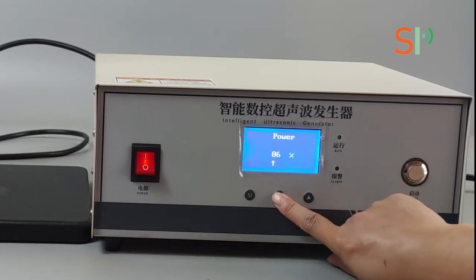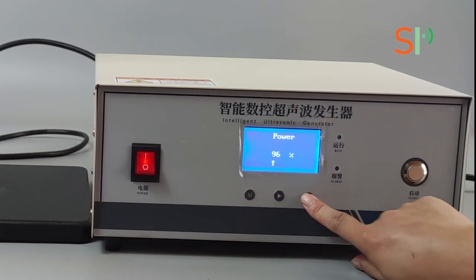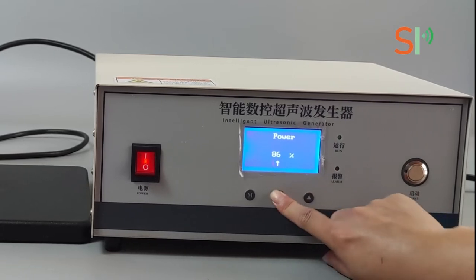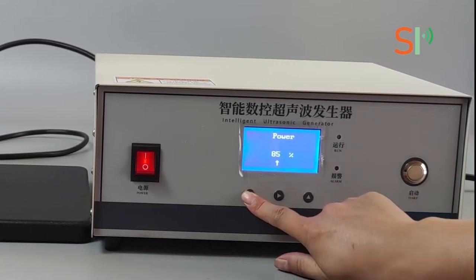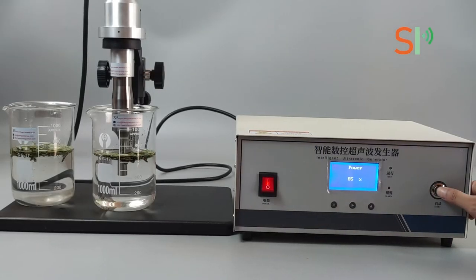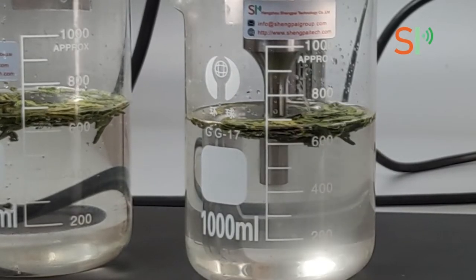Our ultrasonic sonicator is mainly composed of two parts: an ultrasonic generator and an ultrasonic transducer with booster and probe. They are connected via dedicated cable.